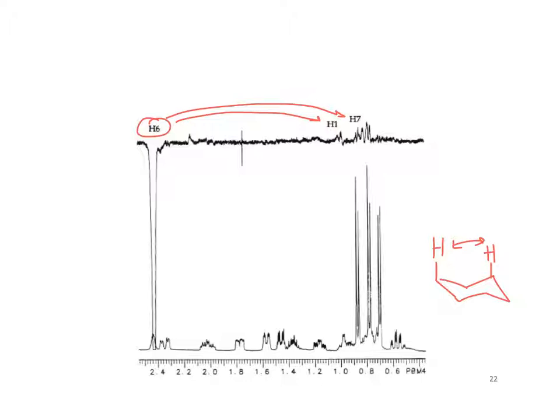Does this work with the metal center? Well, as long as it's not causing things to relax too fast and stuff like that. I don't know if it would work with paramagnetic. It'd be cool to see how the ligands are interacting with each other through space. Right, if they're close enough. Yeah, because we know the crystal structure, but that's in solid form. If it's in an actual solvent, to know.